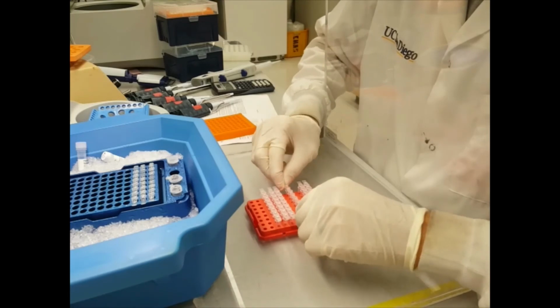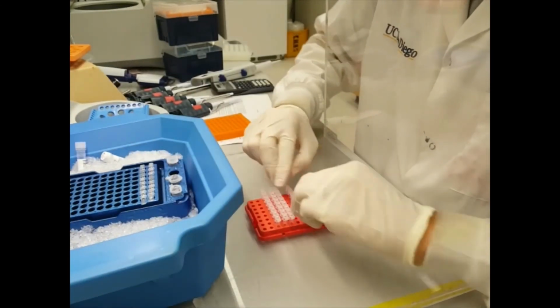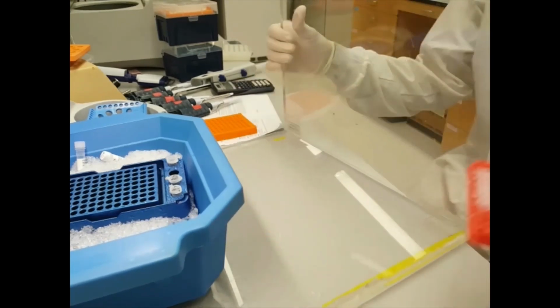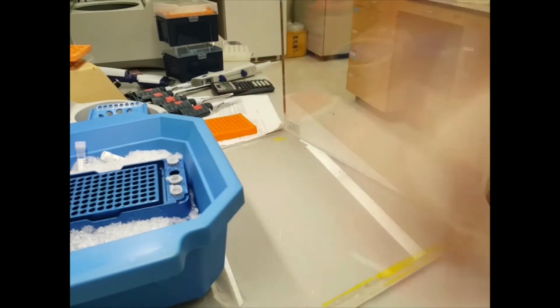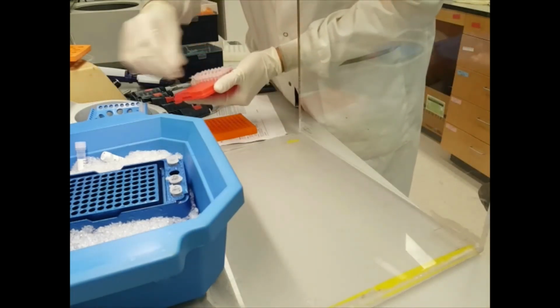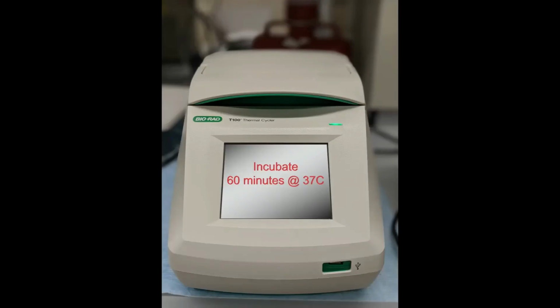Add the RppH master mix onto the RNA tubes. Mix well by extremely vigorous inversion. Yes, I might sound like a broken record, but that is a little bit of a challenge. Mix some more, then quick spin, mix one more time, and then incubate the samples at 37 degrees for an hour. Well, now you have a good 50 minutes to recover before we start preparing the 3' master mix.